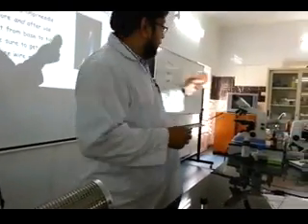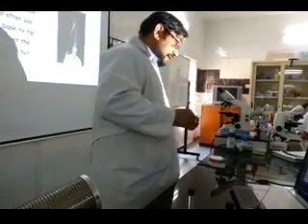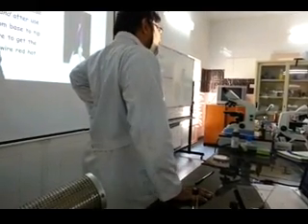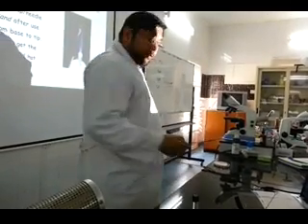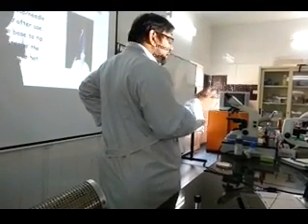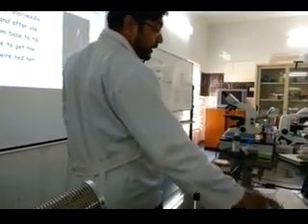This is bacteria, okay? These lines are bacteria. I take bacteria, put it on the slide and then I put it here. If I put it here, the bacteria from here will go to the bench. Then I stand like this and I take the bacteria on my hand. So before and after using the loop, you sterilize. Before and after. Okay? The whole wire from here to there will be sterilized and you put it inside. So first step, sterilize your loop.